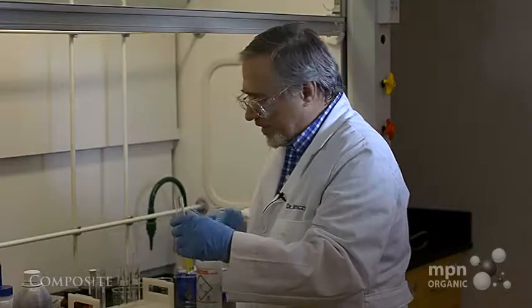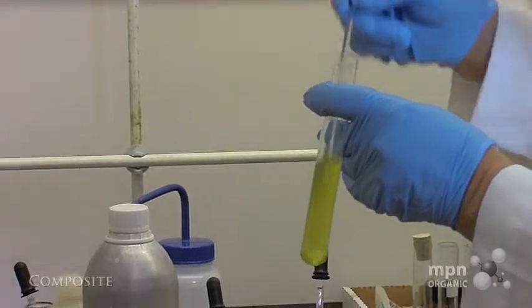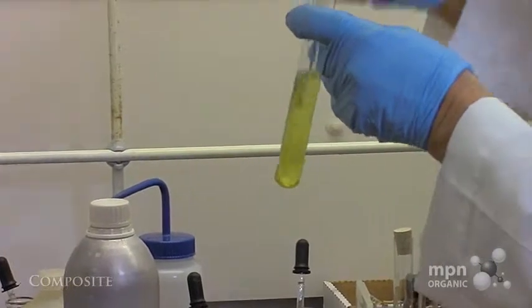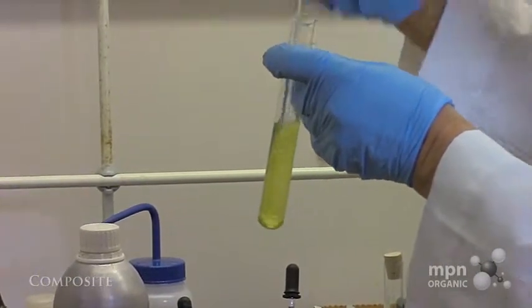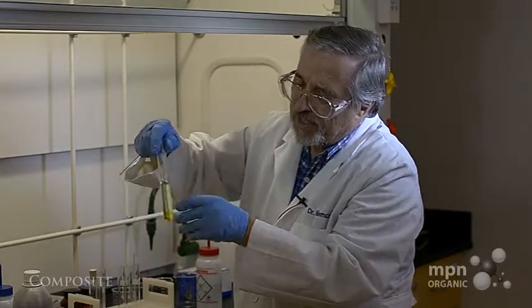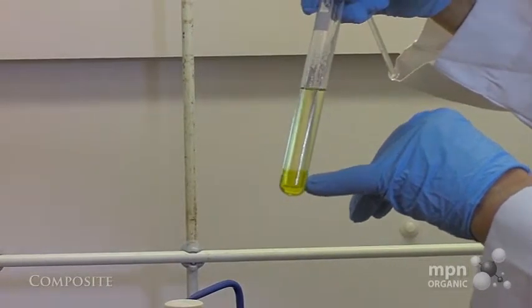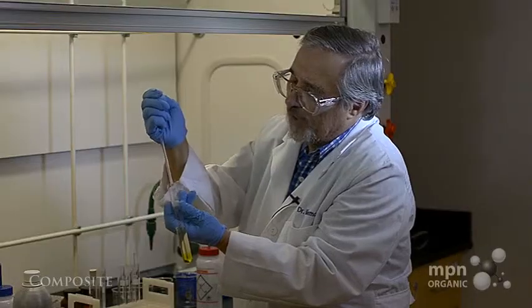And I have a stirring rod here to mix it up. Okay. And you'll notice that there is a yellow lower layer. You see that? That's the aqueous layer. That's the water that I just added.